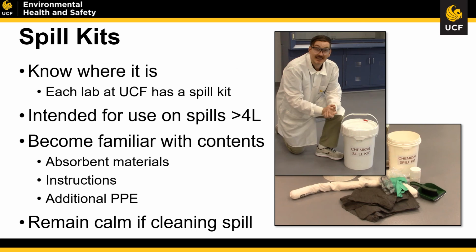Each laboratory will have a spill kit. Please know where your spill kit is. When you first enter a laboratory area, you should always find your spill kit and assess the contents within it. These spill kits, provided by the Environmental Health and Safety Department, are designed to clean up 4-liter or greater spills. Any spill that is less than 4 liters, please use your standard protocols for cleaning up. In the event you have a spill that is greater than 4 liters, locate your spill kit and use it to clean up the spill.